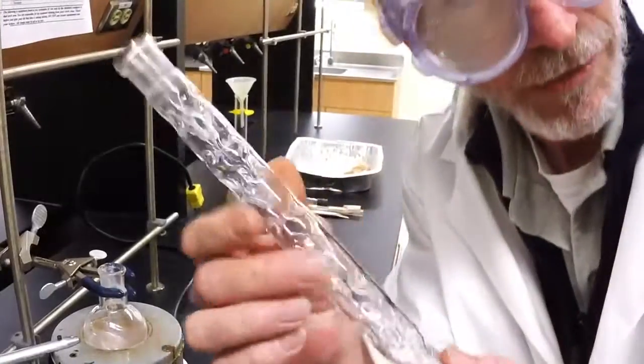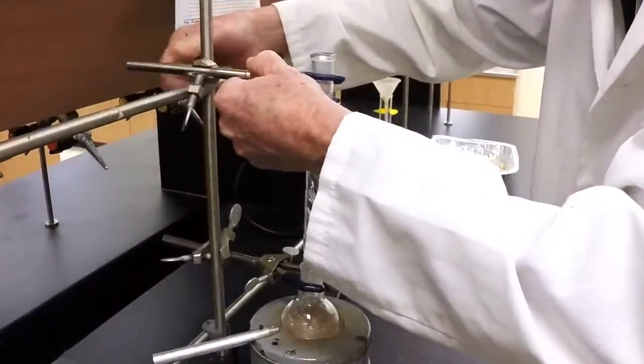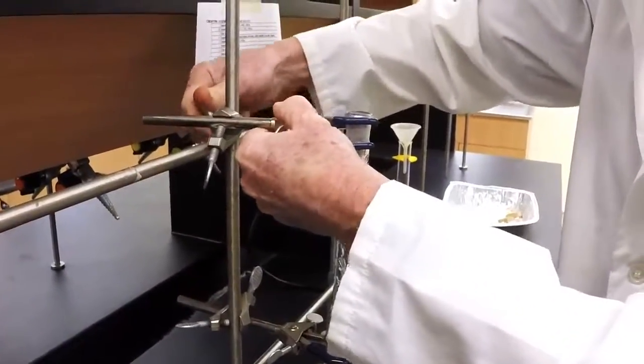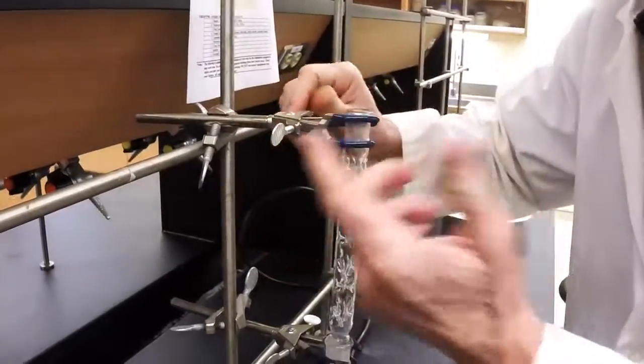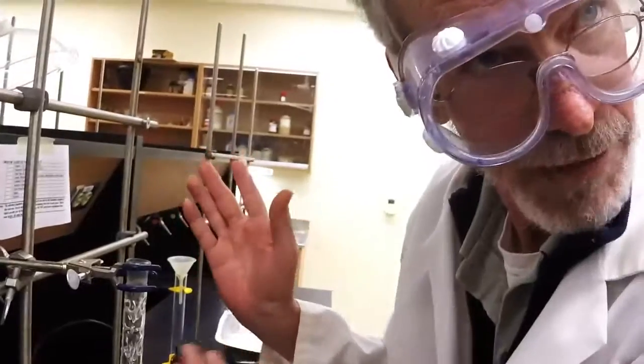We have the fractionating column which goes here. We have a security clamp that goes up here, and this will prevent the whole apparatus from falling over. Falling over is bad.